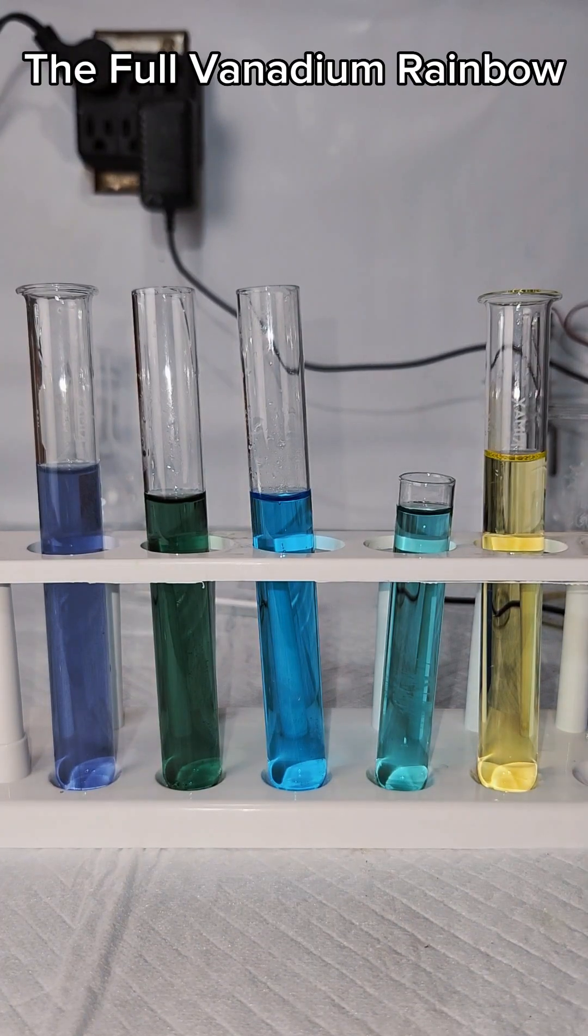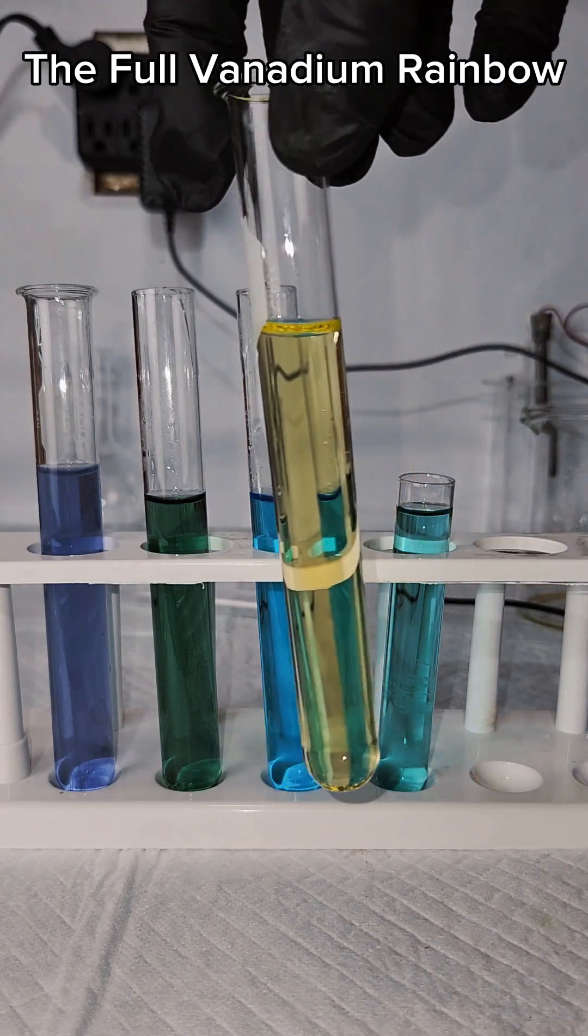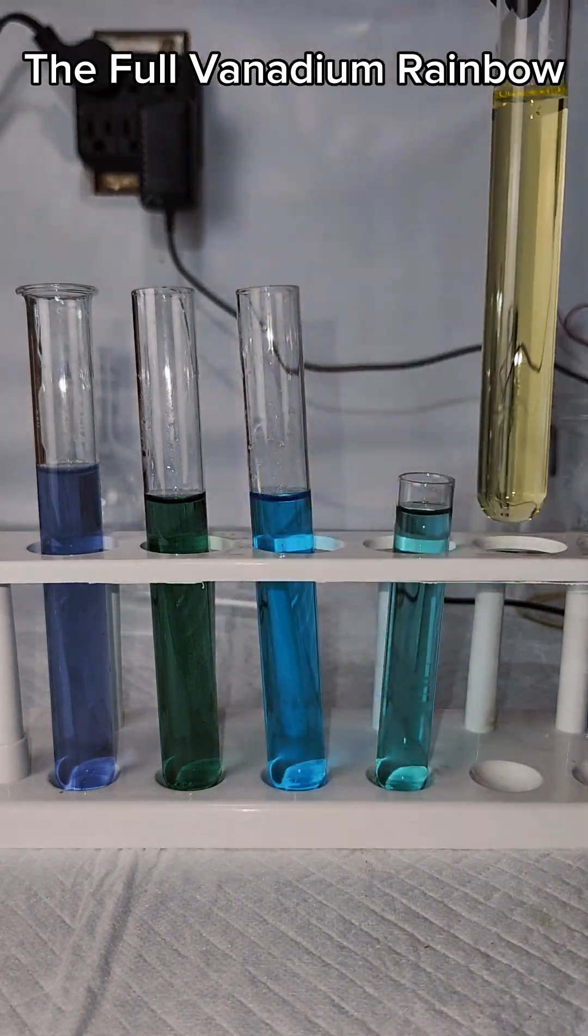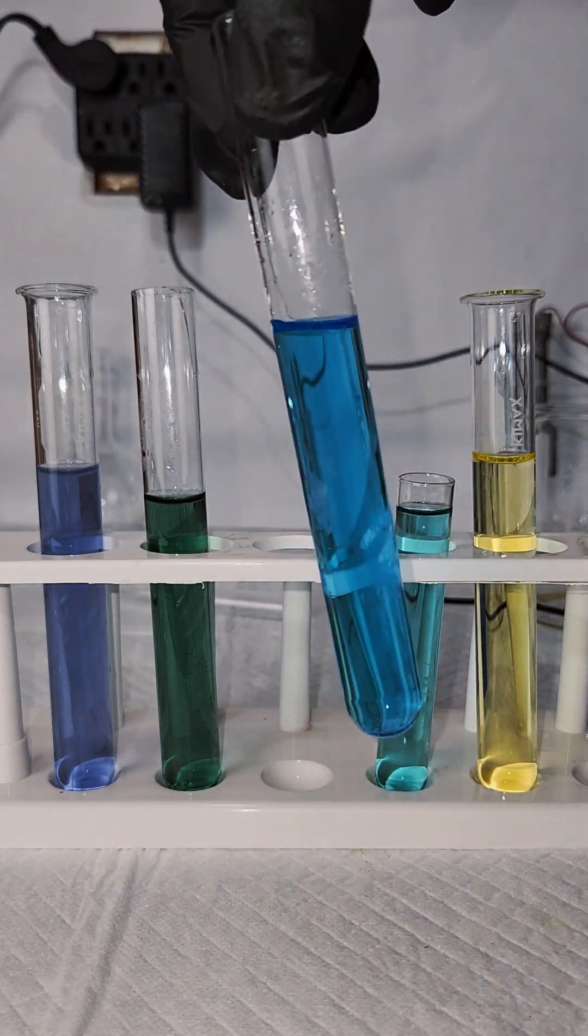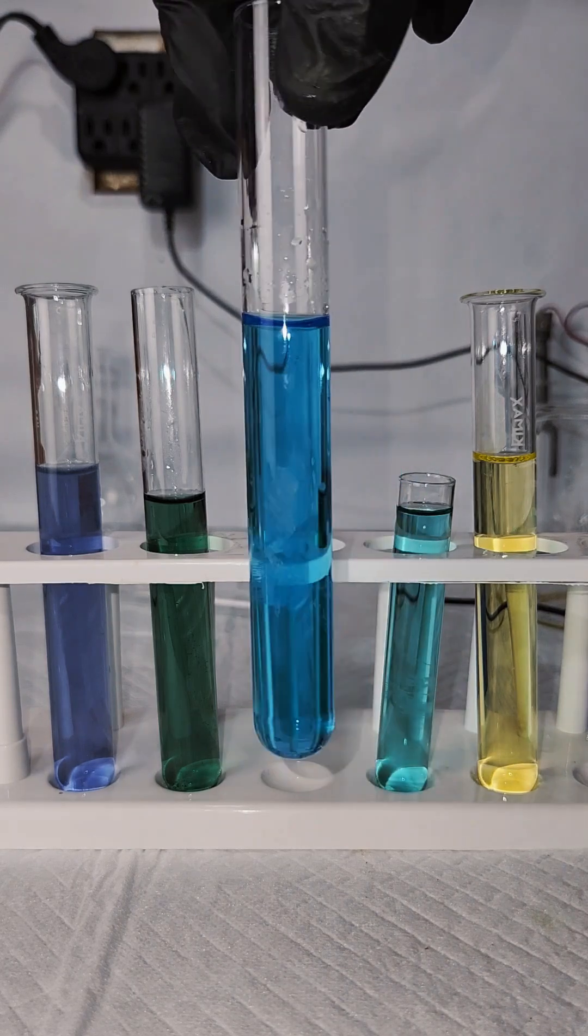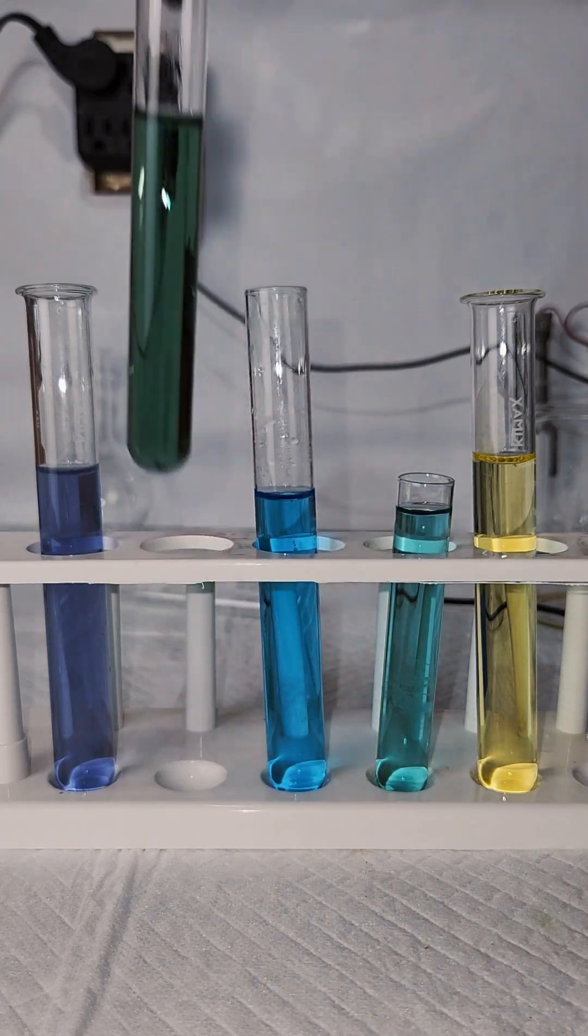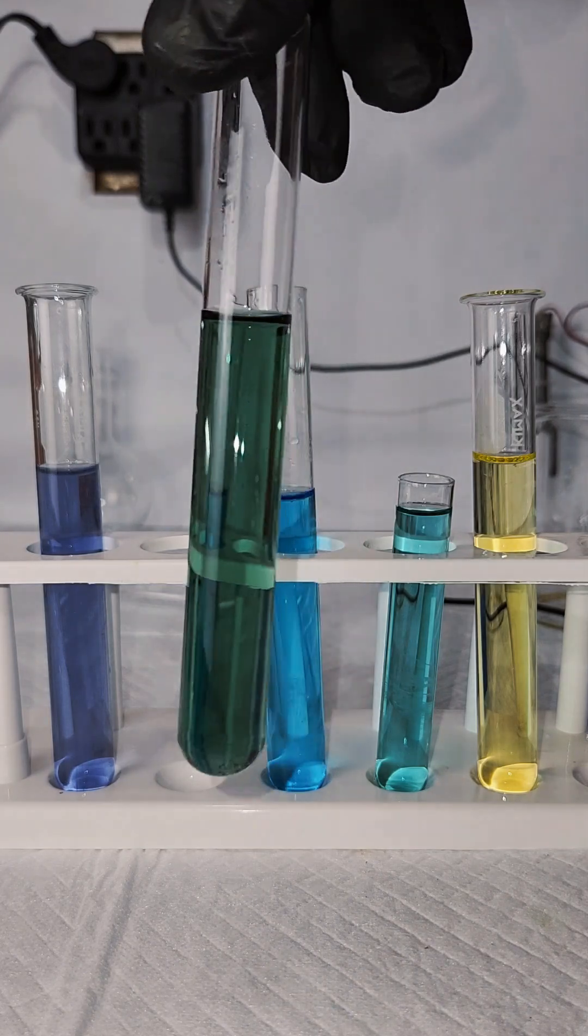In any case, that's the full vanadium rainbow. And here I've collected samples of vanadium ions from all four primary oxidation states. I also collected ions from the sort of in-between state between plus five and plus four.